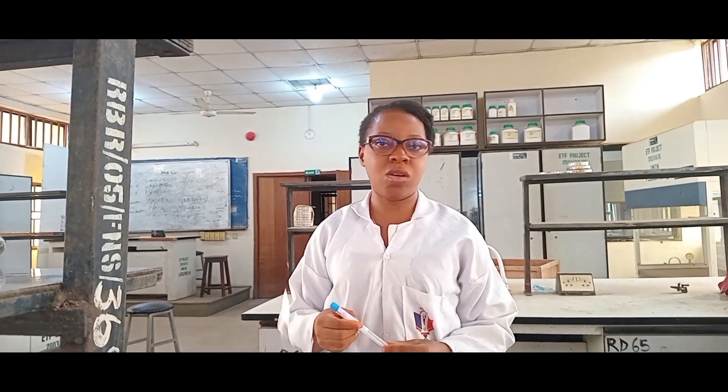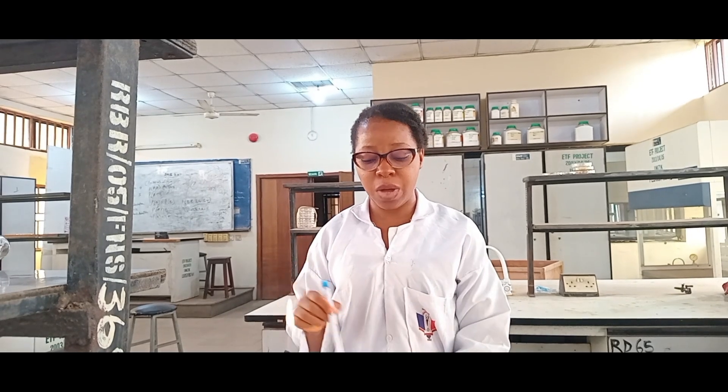After getting the sample from the hospital, we use transport media to make sure that the organisms are intact. Now I want to culture on a petri dish. Something else that you should not forget while working is your labeling.